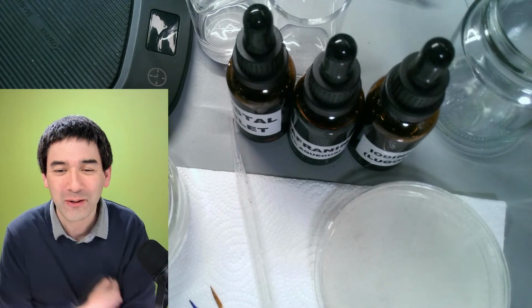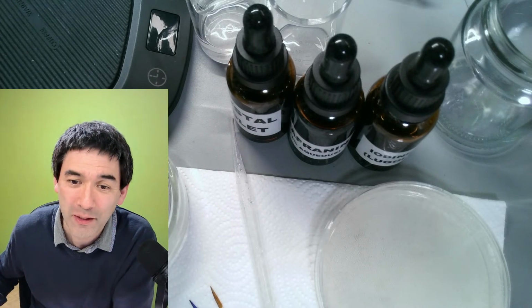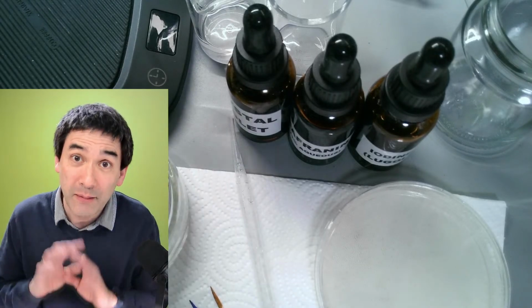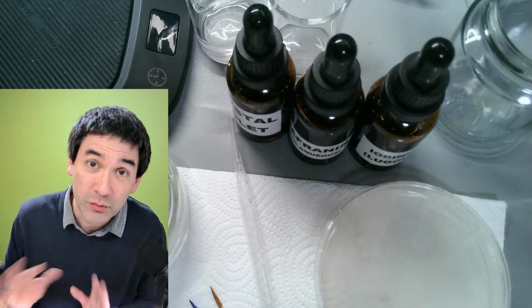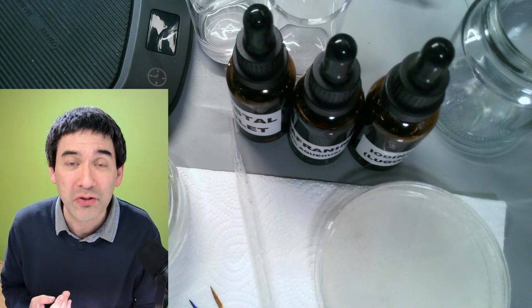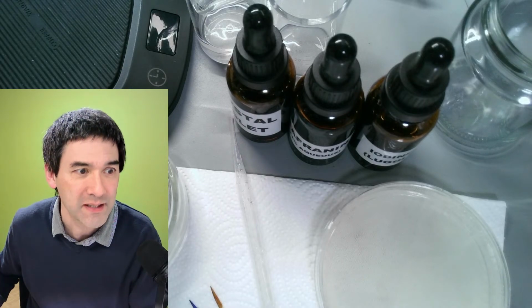Okay, so hello from Ohio, United States, Southern Ireland, and you know what? I'm just going to get started right now with the lab work. The first thing is a little bit of theoretical background, and then I'm going to interrupt myself again, and I'm going to go back into the chat later in a couple of minutes.